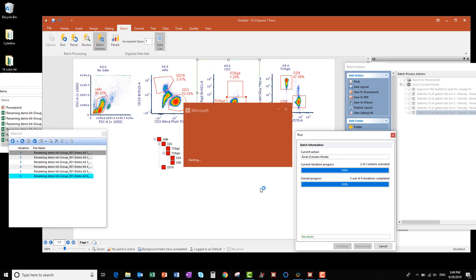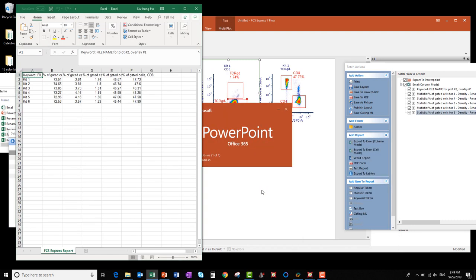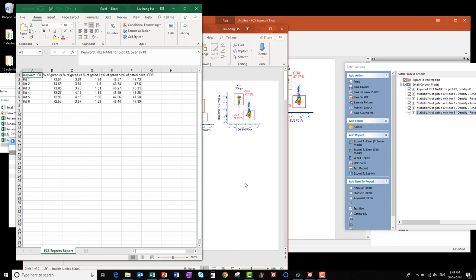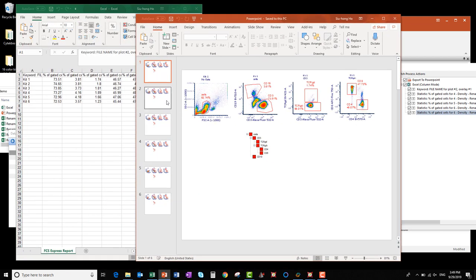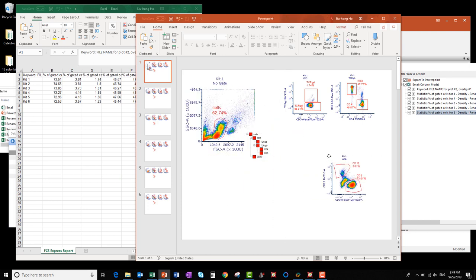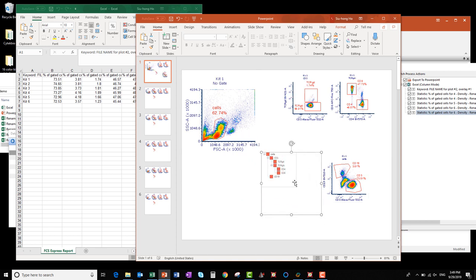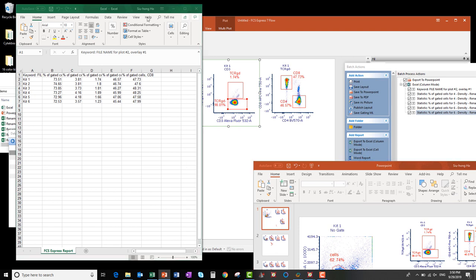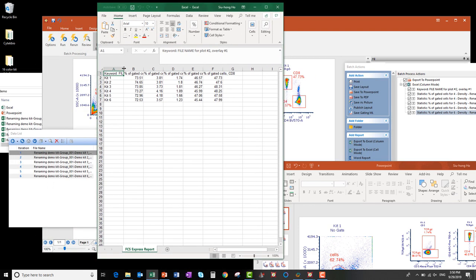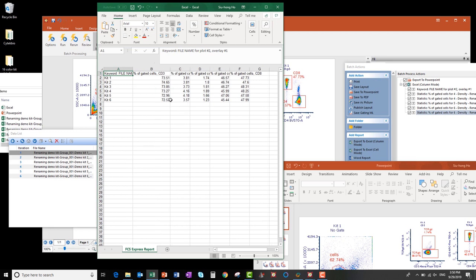When the batch process is complete, both files will open automatically. In the PowerPoint file, the gated data from each file is shown on its own slide. You can resize and move the plots around anywhere you'd like on your PowerPoint slides. You can also do this for the population hierarchy — resize it and move it anywhere you'd like for your presentation. In the Excel file, you can see a column was generated for the file name keyword and each of the statistics I specified, with data from each of my six FCS files across the rows.